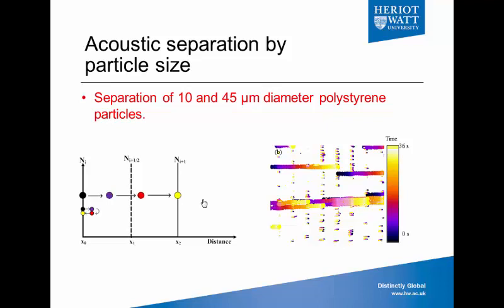Then we leave it to rest, the resting time, where the large particles move to the next node while the smaller particles go back to their initial position.